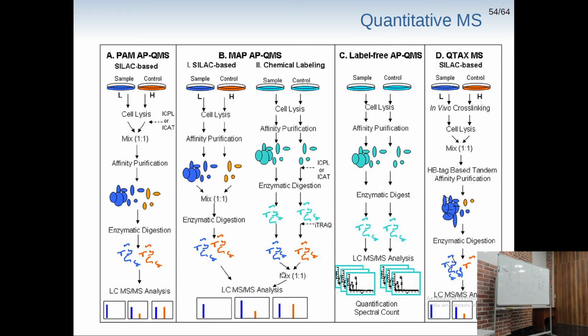So, the idea is here, and we have to cover now quantitative mass spectrometry, because actually this data-independent acquisition is really nice, and it is more quantitative than what we've had with data-dependent acquisition. But if you have, for instance, two samples, a little bit different samples, and we get mass spectrometry information from those samples, what do you think?